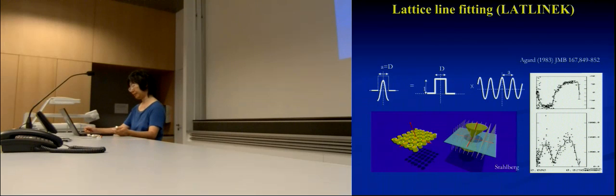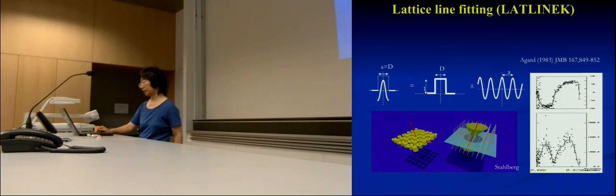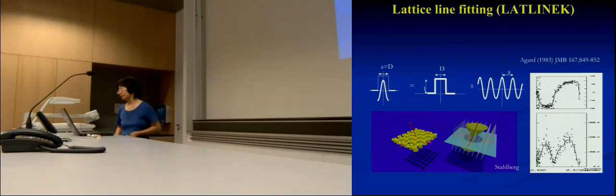It was written by David Agard while he was in MRC in 1983. And it's a very good program, complicated inside, in terms of how it does fitting, how to get the function over. But 2DX will help you to set up the parameters, so it's not as bad. Now first, Henning already told you about the lattice line.